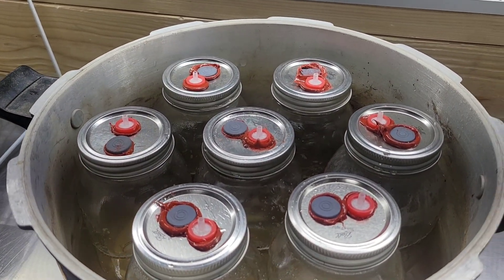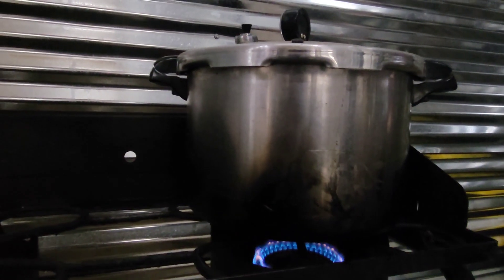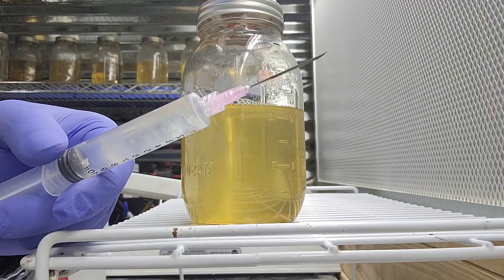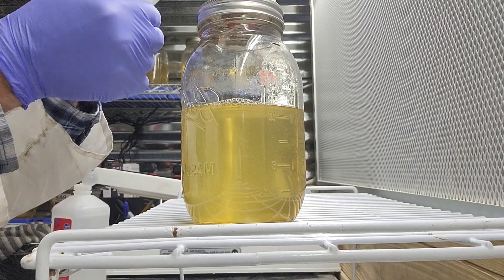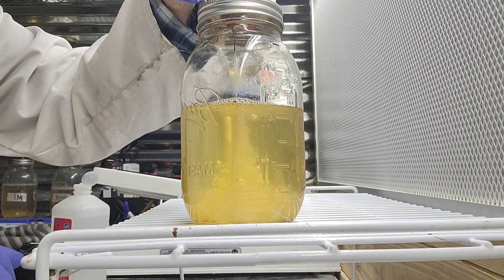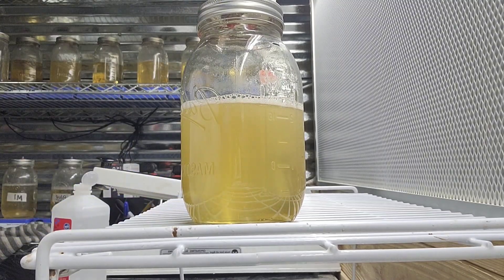We're going to sterilize our solution by pressure cooking these for 30 minutes at 15 PSI. After you finish the sterilization process, allow your jars to cool to room temperature, then you can inoculate them with a starter culture like the liquid culture I'm using here. I will also have videos in the future about inoculating your LC with agar or a tissue biopsy, so stay tuned for those.